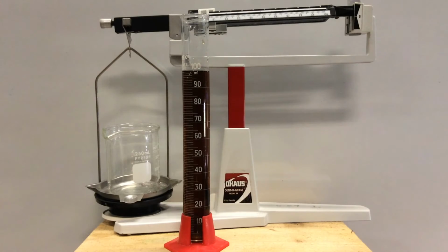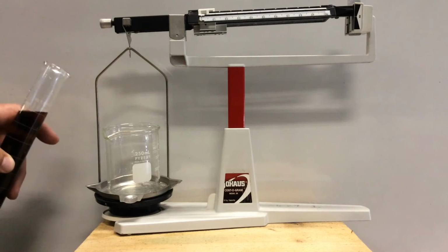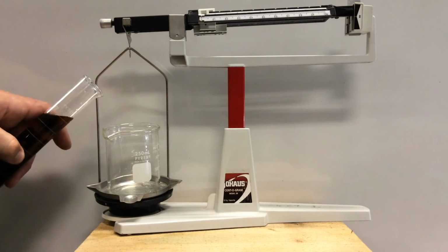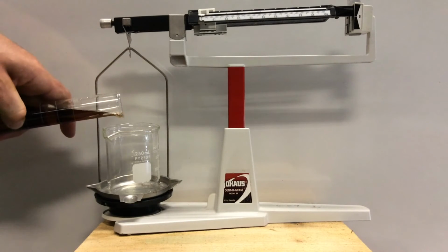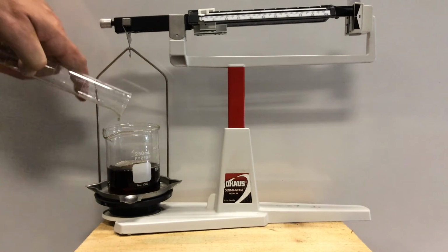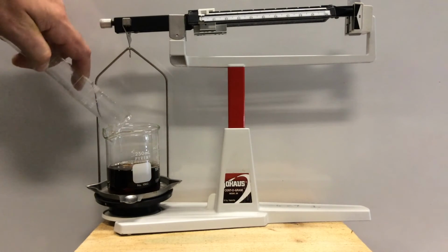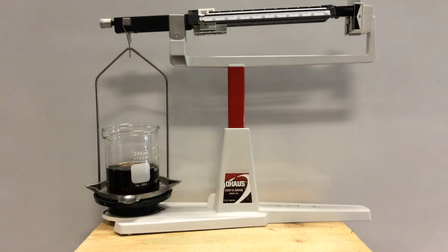and now I'm going to fill my container. I'm going to use the same mass in my container. If you think that's an experimental flaw, you should think about that for your errors in your lab write-up. So I'm going to pour the liquid in, same container, we know its mass. And let's go re-zero it out.